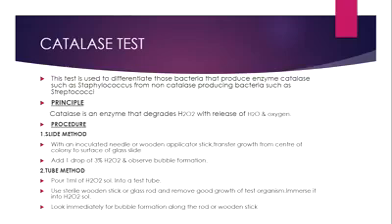In slide method, we need a slide and of course the test organism. And how are we going to perform it? With an inoculated needle or wooden applicator stick, which should be sterile, we're going to transfer a growth from the center of the colony to the surface of the glass slide, and then we're going to add 1 drop of 3% hydrogen peroxide and observe for bubble formation.